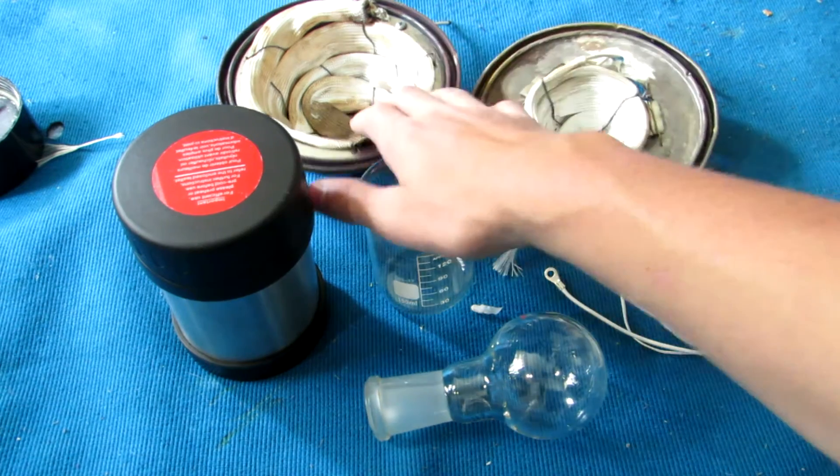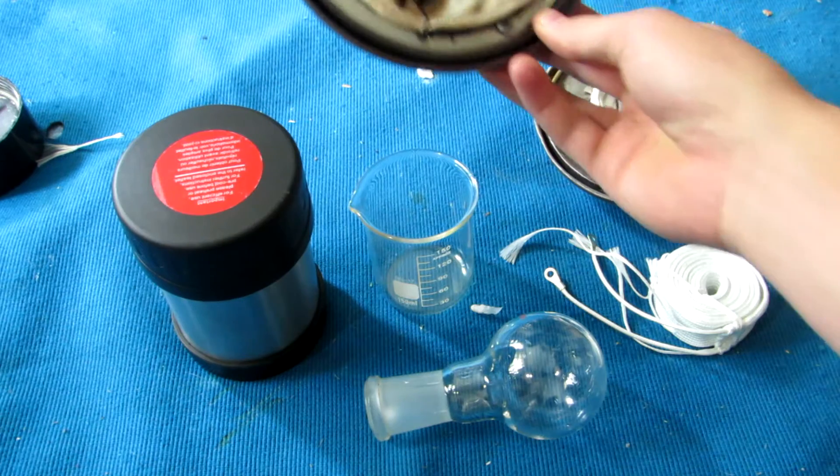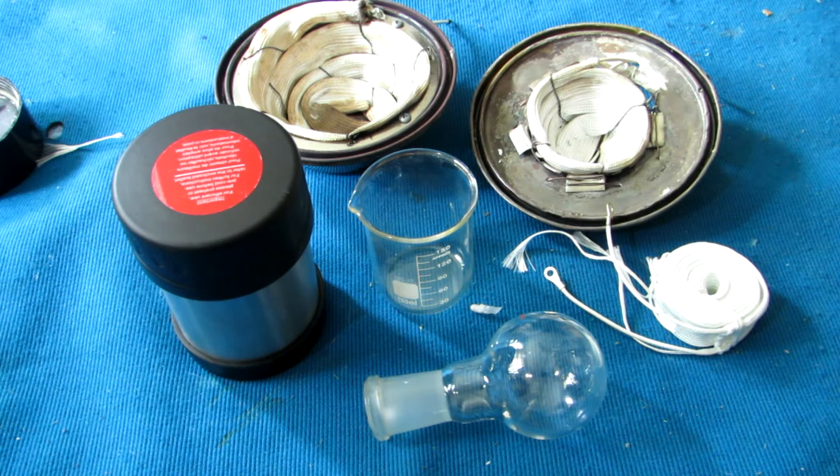In a previous video, we made a high temperature heating mantle that could be easily altered to accept different sized round bottom flasks, and this is just a quick continuation. The heating mantle previously made works very well, however there is a lot of conductive heat loss into the surrounding steel, so for applications requiring very high temperatures, some sort of thermal insulation is necessary.